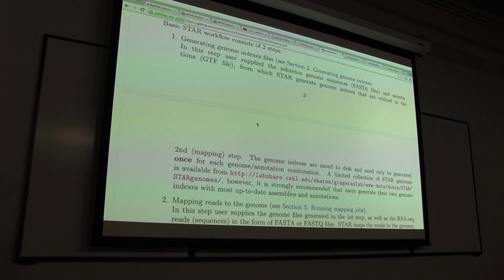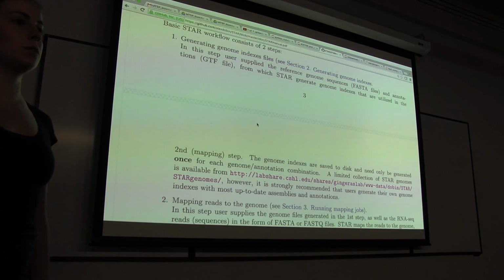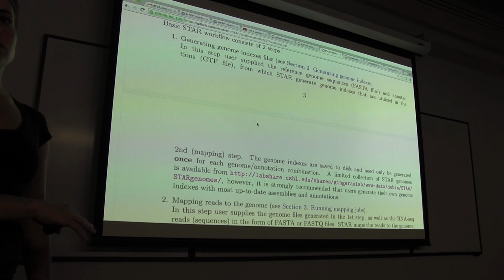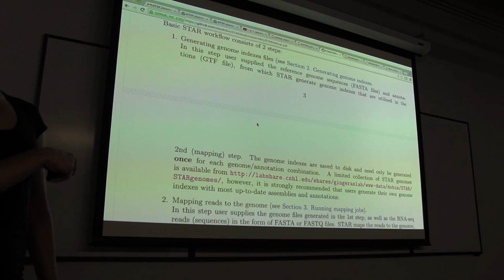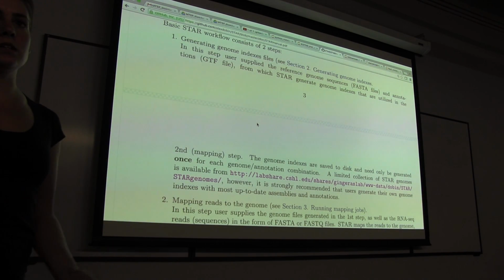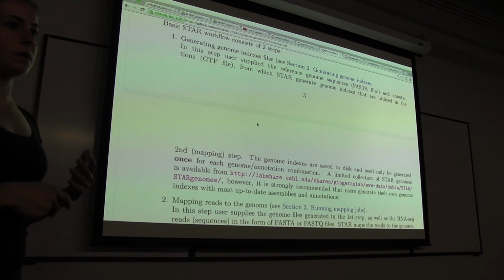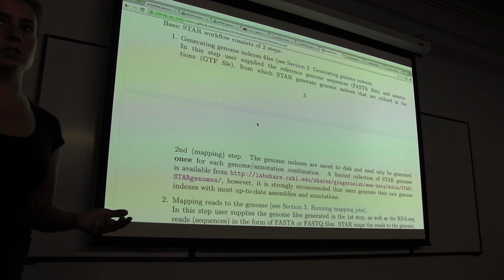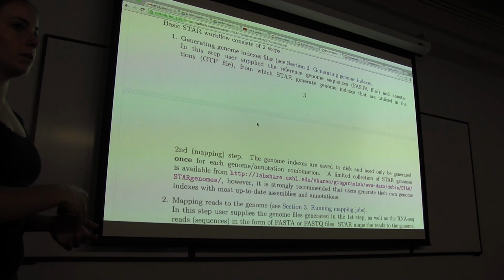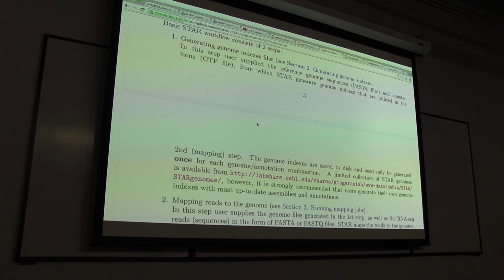Okay, so to start, we're going to need to get these files for the human genome HG19. And I'm going to walk you guys through where we get these files. We're going to do a particular example for human HG19, but if you're interested in a different annotation, a different genome build, a different organism, you should be able to follow the same procedure using these very common databases where all of these things are stored.